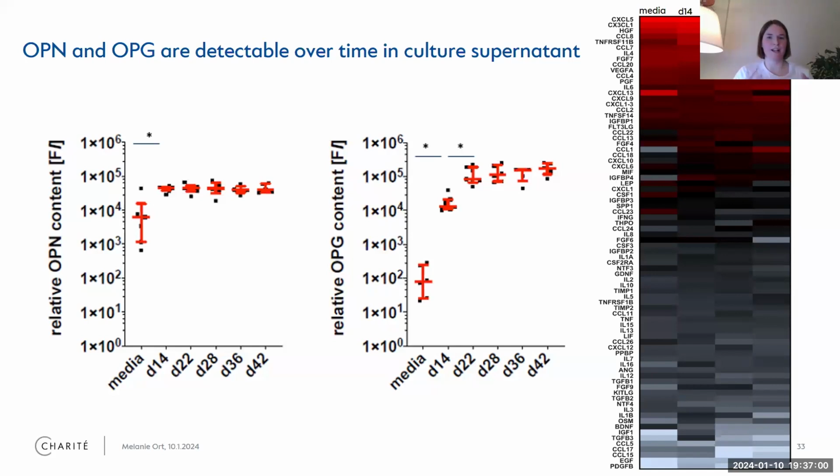So we just try to see what's in there, and we try to make educated guesses, but in the end, you end up just doing an unbiased screening and then see what's interesting and just follow up with that. So I have been doing a lot of those cytokine arrays, and it's still really cool to see what's happening. And I really want to point out lots of cytokines that we say are, for example, pro-inflammatory, so are part of a cascade when you're sick or when you injured yourself.